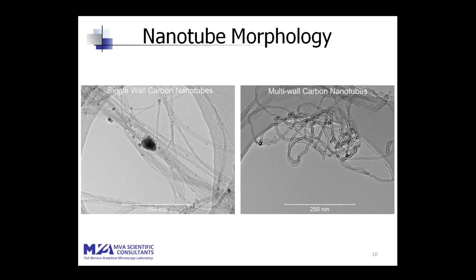And they have some unique characteristics that separate them from multi-wall carbon nanotubes, in that they often exhibit superior electrical conductivity compared to their multi-walled counterparts. And there's images of those on the left. And on the right we have multi-walled carbon nanotubes. These are larger, more robust nanotubes. They don't have the same electrical conductivity that some of the single-walled nanotubes exhibit, but they are larger and more robust, so they serve some other purposes as well.